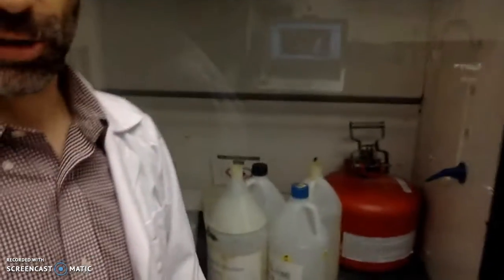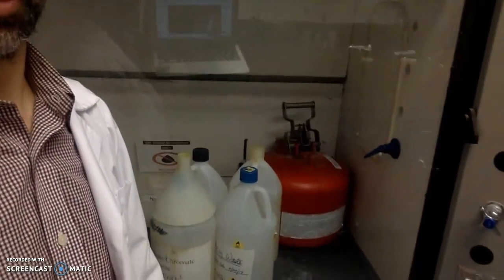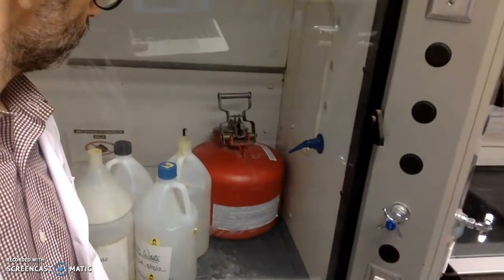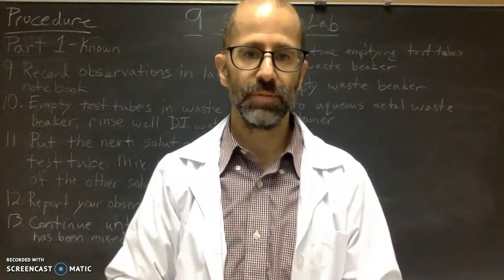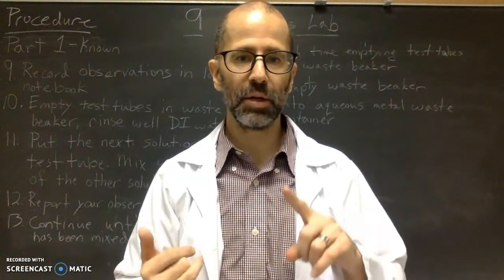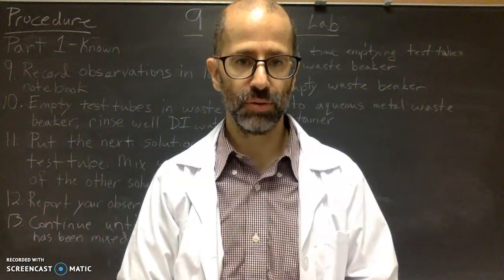If you come over here, you'll see that big red container. That is where you put the metal aqueous solutions. So that is the first day, where you're doing the knowns. That's day one. Day two is the exact same thing, except you are now mixing unknowns.